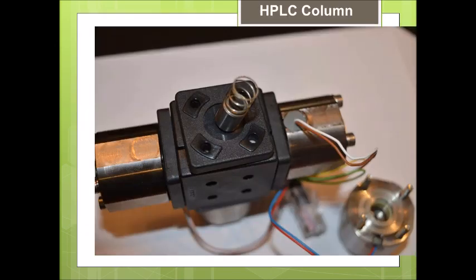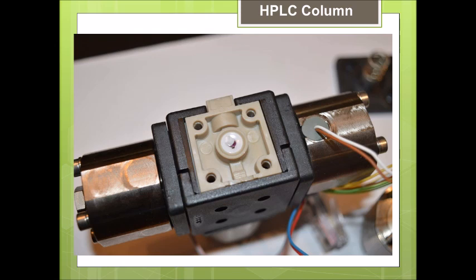When we open up the solenoid valve, as you have seen before, there is a plunger and there is a spring that you need to remove until we get to the lower part. As we remove the lower part, this is what we see: there is a membrane, there is a sapphire sphere, and there is a semi-cylinder that sits on the top of the sapphire. So this is the close-up of these four parts.